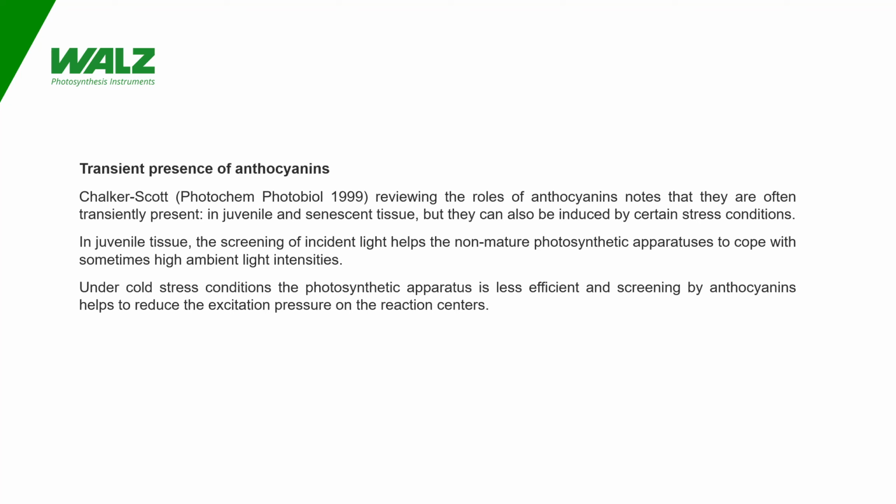Under cold stress conditions, the photosynthetic biochemical reactions slow down, whereas the photochemical reactions can occur with the same efficiency. There again, the presence of anthocyanins reduces the excitation pressure and thereby the risk of cold-induced damage.